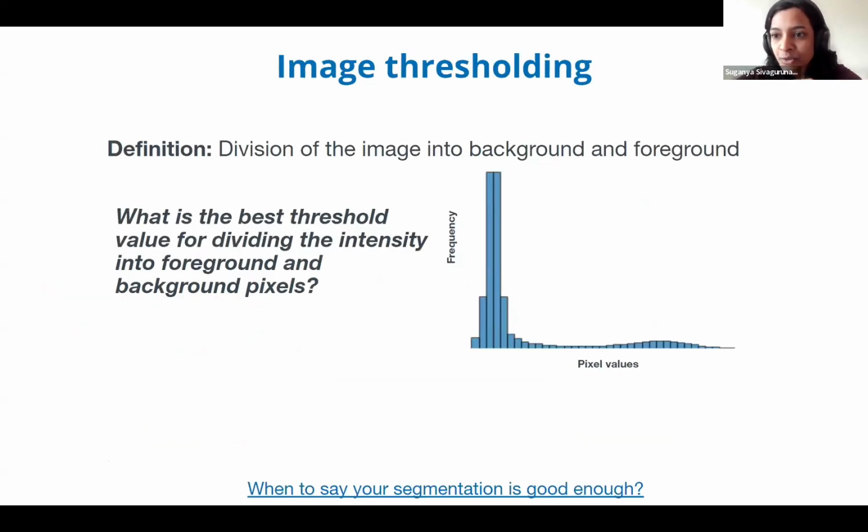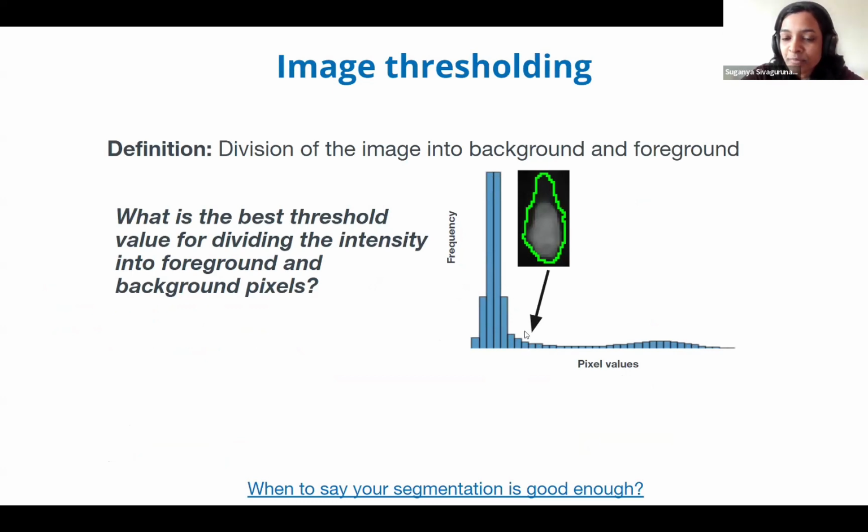Thresholding is a process where you partition your image into foreground and background pixels. And how is it done? Generally, when you display your image in a histogram fashion, you see these high frequency background pixels and also the low frequency foreground pixels. You care about only the foreground pixels more. How do you divide it? If you choose a threshold value somewhere closer to your background pixels, you could see the identification of objects is done in such a way that, along with your objects of interest, some background pixels are picked up as well. This is not what you want.